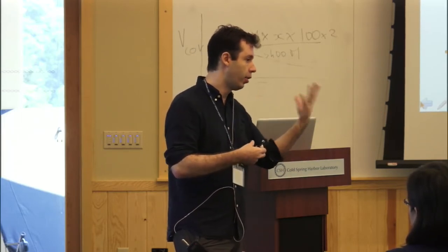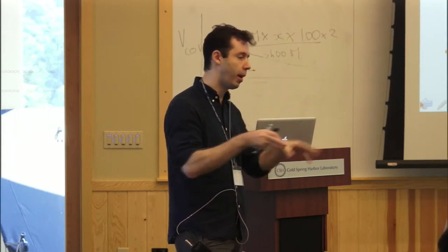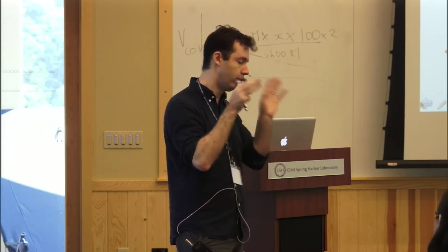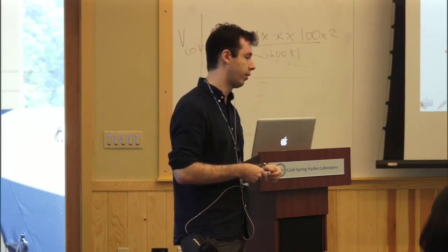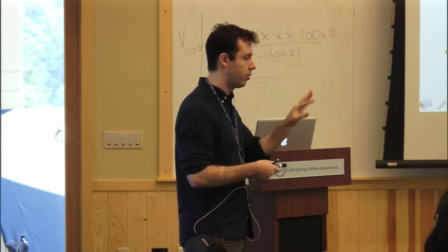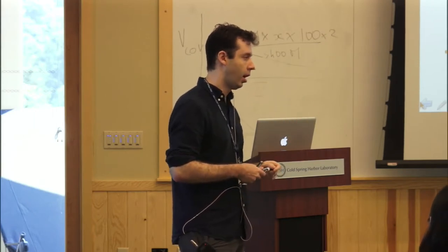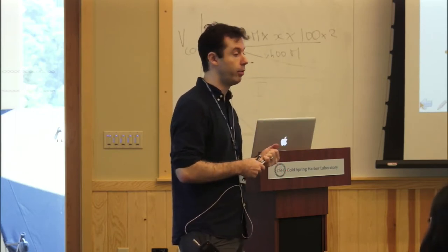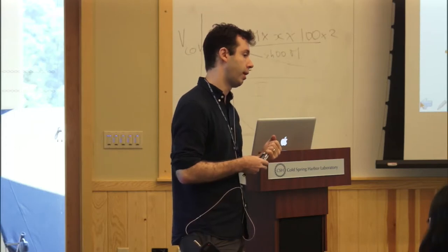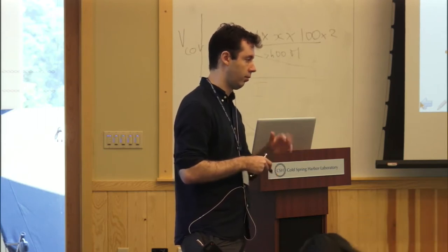And that's where your binding site is fundamentally in a repeat region. So everything that I've been telling you about repeats doesn't apply to this. You would have to do a very careful analysis with longer reads to really be able to tackle the situation. I'm not talking about the general situation where you're not interested in a biological problem that involves repeats. But in your case, I think you probably benefit from longer reads so that you can map the locations of these binding molecules. But that's a specific problem.